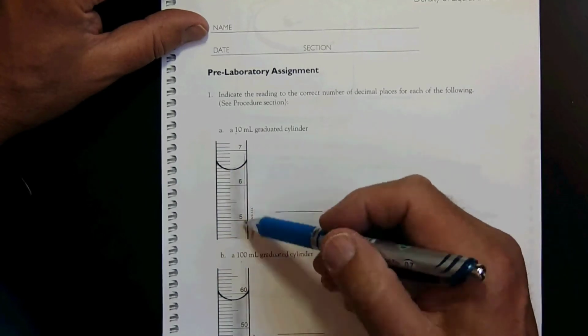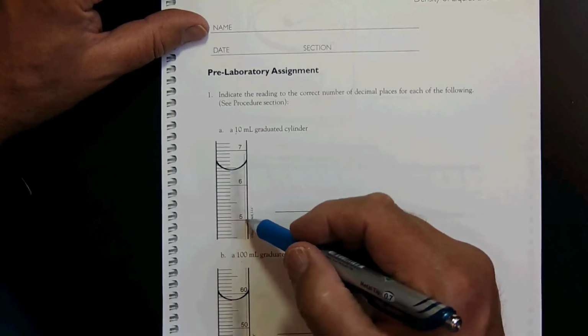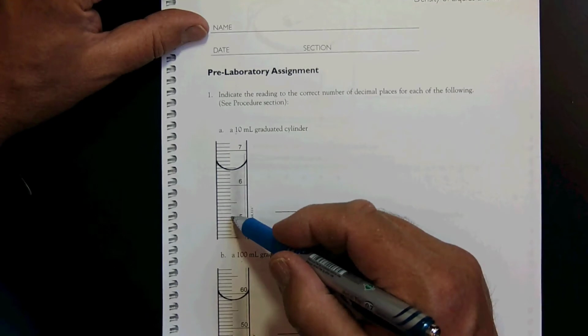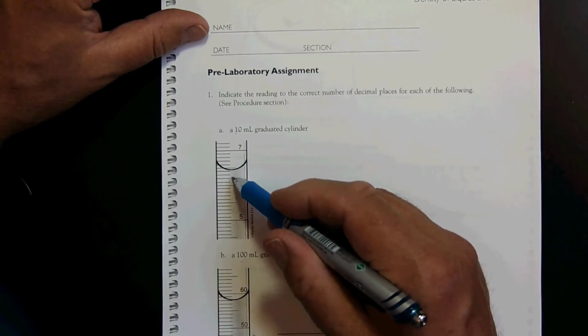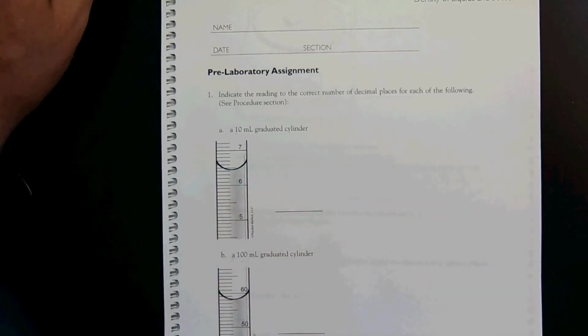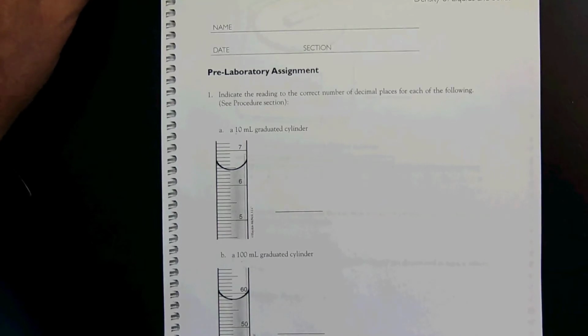So if you're looking at this graduated cylinder, this is 5 milliliters, this is 6, so this is 5.1, 5.2, 6.1, 6.2, 6.3. So this graduated cylinder is marked in tenths. If it's marked in tenths, you read it to the nearest hundredth, or 2 decimal places.